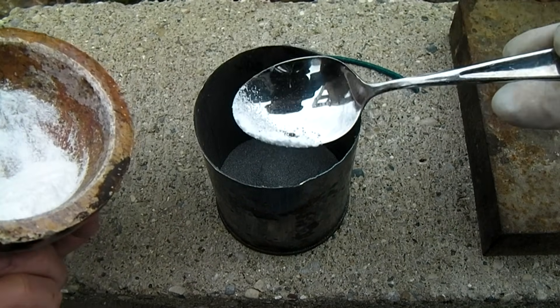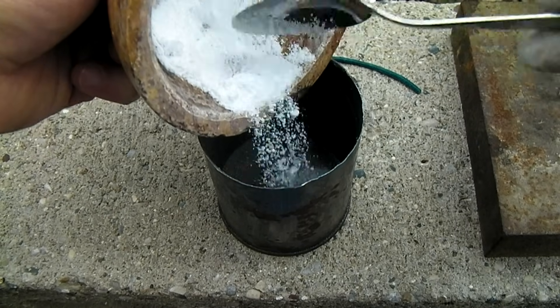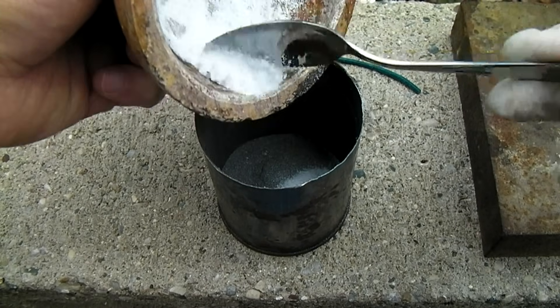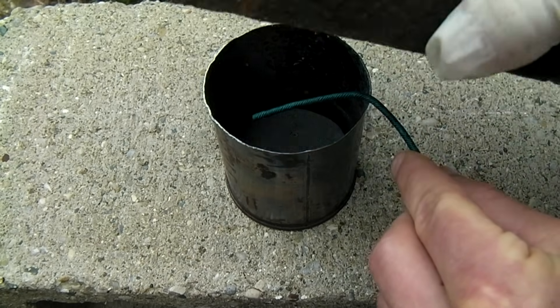The sodium hydroxide is then combined with the magnesium powder in a steel container. A fuse is inserted into the container and a heavy lid placed over it.